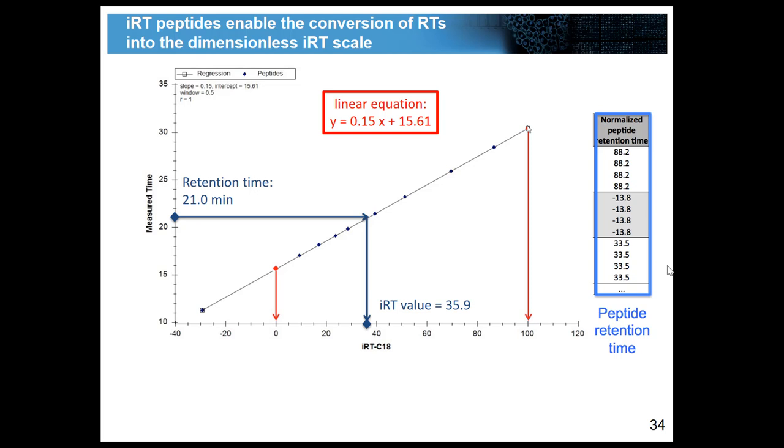Why, maybe if you have your own set of peptides that you want to use, you don't need to do this at all. So I heard the rumor that this first peptide was quite irreproducible. It had a bigger variance between instruments, so they decided to go for this one. It is completely arbitrary, and if you do this yourself, you can also put this value to 1 million or 2 million. You decide; you can use any number.